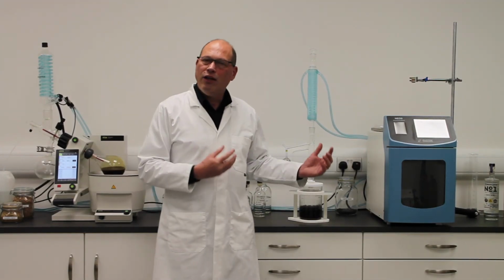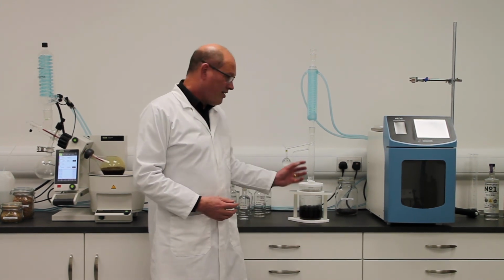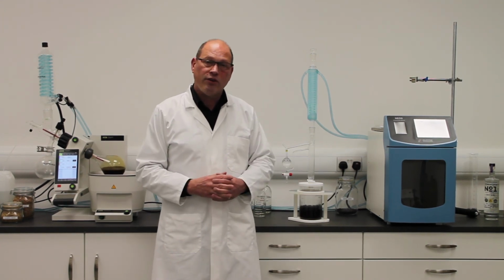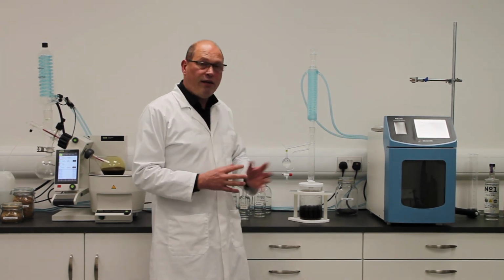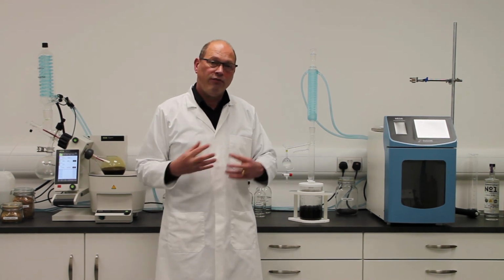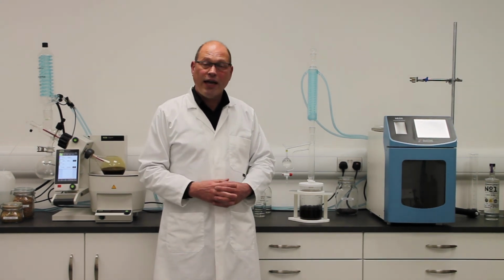So, you know, it looks easy in theory, but in practice, it takes a lot of practice to actually optimise your conditions for the particular botanicals. There are a number of variables you need to take into account. One thing I didn't mention is that you can modify this to run under vacuum. So if you've got some more delicate botanicals you want to extract the essential oils out of, you can do that.